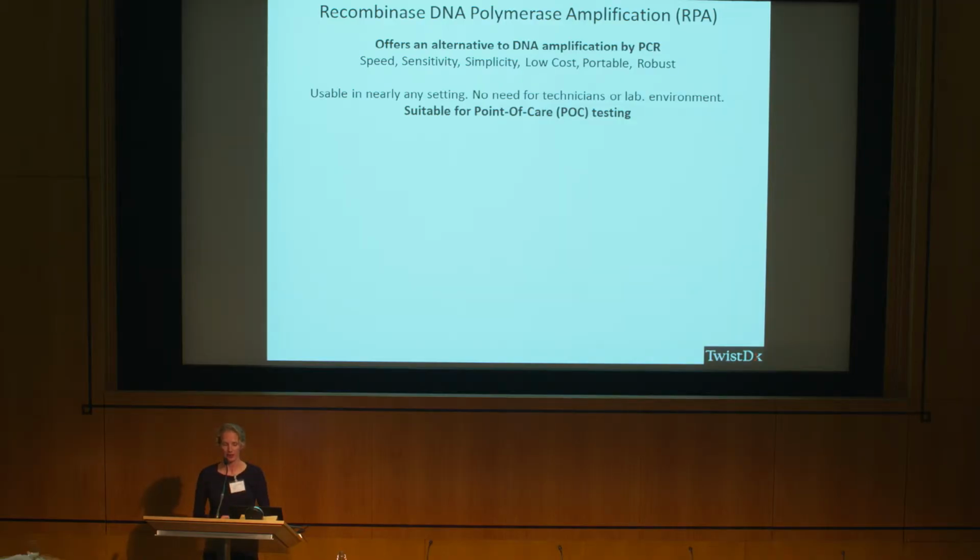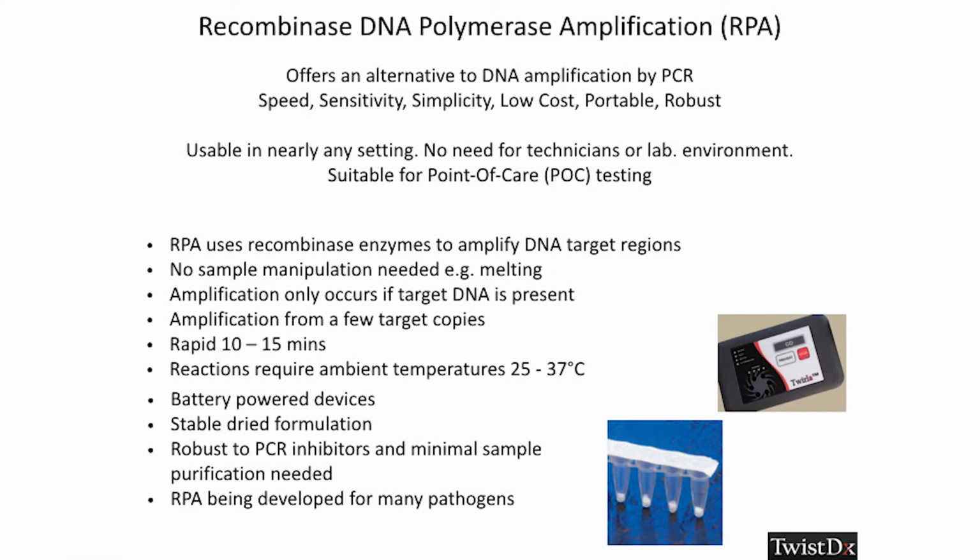And this is an alternative DNA amplification method. It's the same sort of principle as PCR, but it's isothermal. It's very quick, sensitive, simple. It can be low cost if you start to multiplex it, or you can start to split reactions. It's highly portable, and it's been shown to be very robust. And it has very great potential for point-of-care testing.